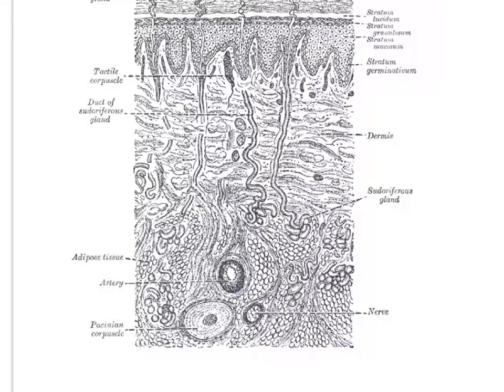And then you're going to find that sweat gland, and you can totally see it. If you adjust your magnification so you're in line with it, you can totally see that duct going up towards the surface of the skin. I don't think it makes it all the way up, and we're going to lose it in the slice in a minute, before it gets to the surface. But there's another Meissner's corpuscle, and then you're going to go down and back to look for that Pacinian corpuscle, which really just looks like a wad of skin at this point. It's kind of weird. But that is actually nervous tissue. So you don't see fat cells. It doesn't look like fat cells. It doesn't look like connective tissue, right? That's nervous tissue right there with that Pacinian corpuscle.